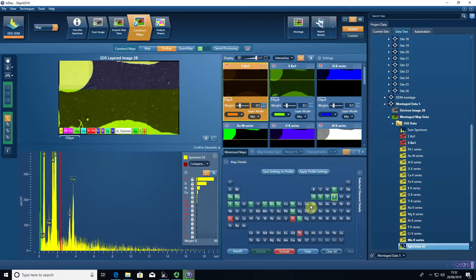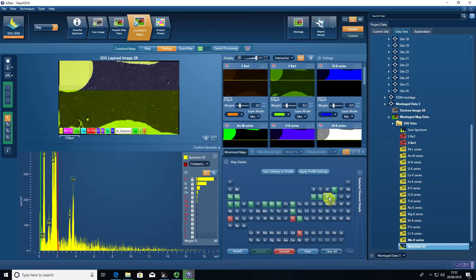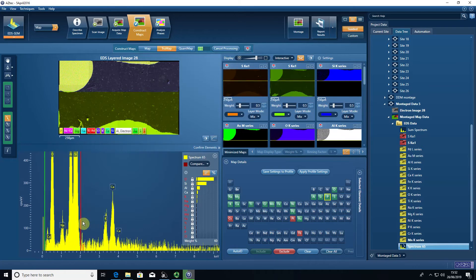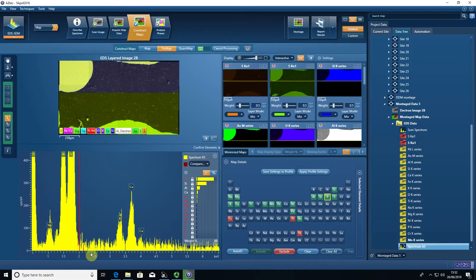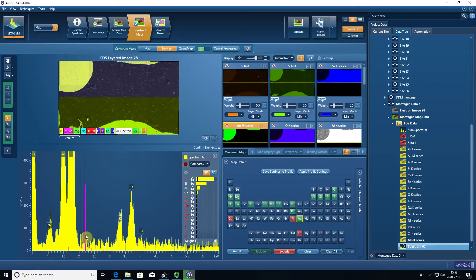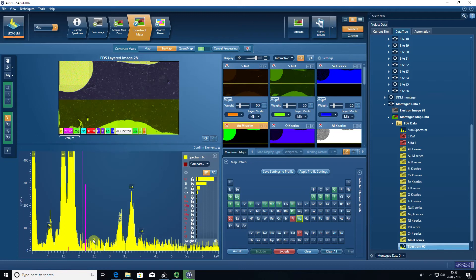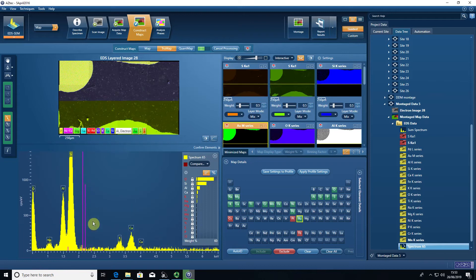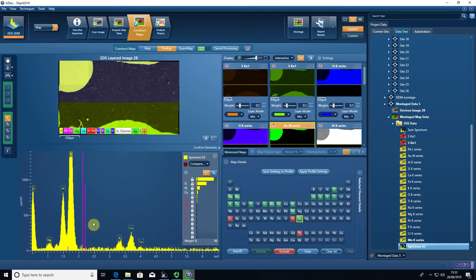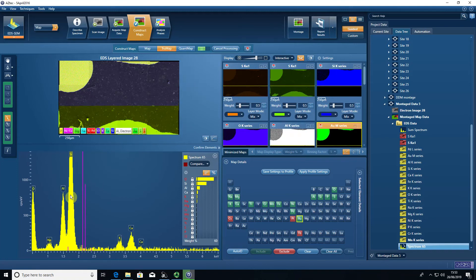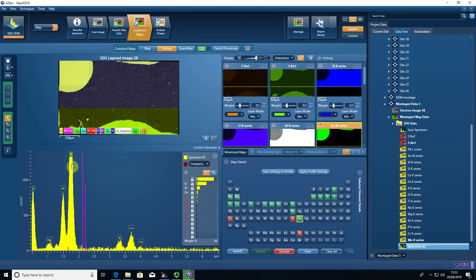So for example, phosphorus, which has an energy around about 2 kiloelectron volts for the x-ray peak, has an overlap with gold at around about the same energy. So the software will mathematically deconvolve any overlapping peaks. By pressing true map, we're making sure that we're dealing with absolute concentrations above background and that we've dealt with any overlapping peaks.